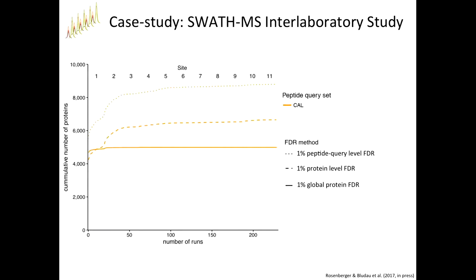Yes, you can do that. That's more or less the standard way to do it. The question is, how do you get enough decoys in this setting that look different from each other, right? Because of the kind of things that Ludovic talked about, where you're trying to ensure that the decoys resemble the targets, when you try to generate the next set of decoys, they're not totally independent from the first set of decoys. So statistically, it's very difficult to estimate the true underlying variance.